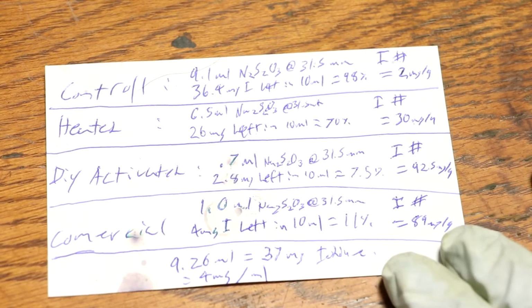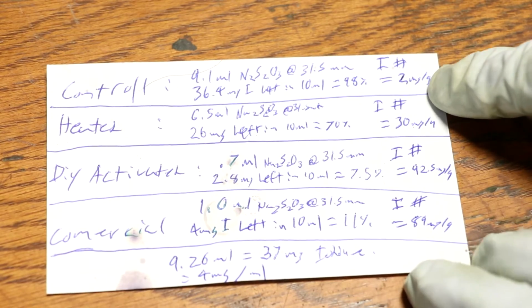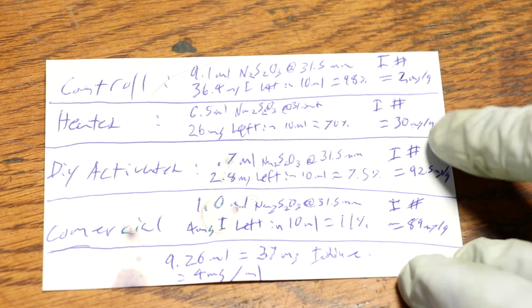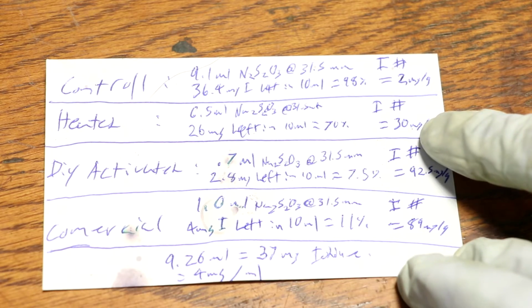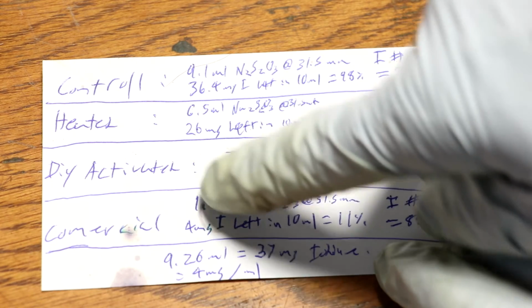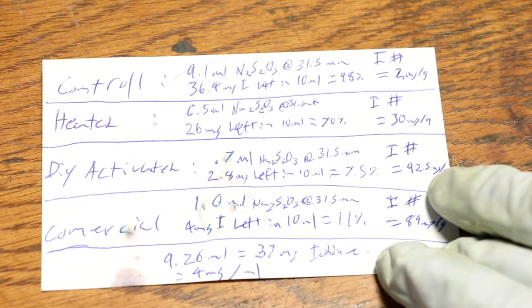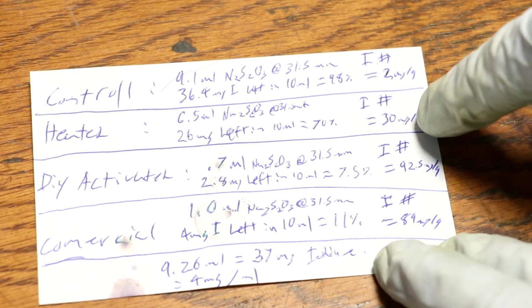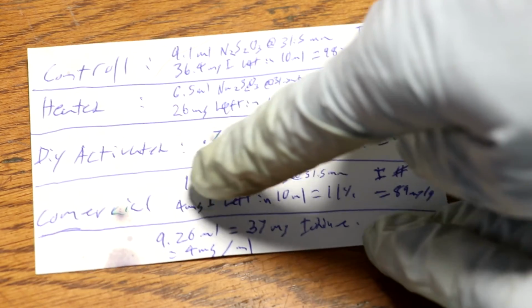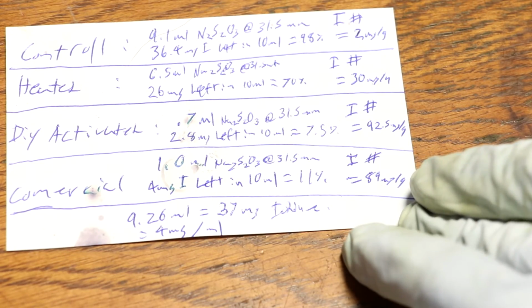So here are my results. The control, the original charcoal, was able to absorb only 2 milligrams of iodine per gram. The stuff that we heated up managed to absorb 30 milligrams per gram, which is quite a lot actually. That's a pretty substantial jump there. The stuff that I activated with steam managed to absorb 92.5 milligrams per gram. That's more than the stuff that we just heated up, so the steam definitely helped. And the commercial activated carbon absorbed 89 milligrams per gram.